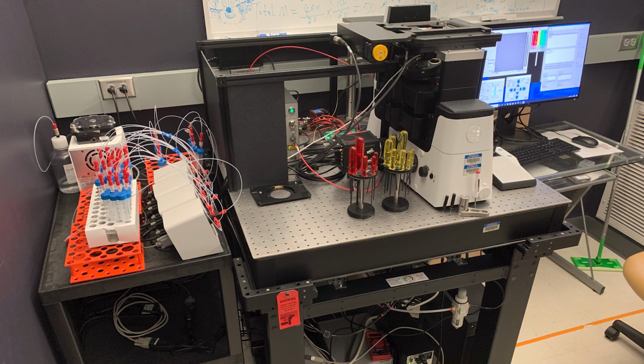The next steps of RAEFISH development include combining RAEFISH with tissue clearing to allow thick tissue profiling, further increasing the detection efficiency and coverage of RAEFISH, and developing in vivo applications of perturbed RAEFISH. To access the RAEFISH technology, a key requirement is to have an automated imaging and fluidics platform. We welcome researchers who are interested in setting this up to reach out to us, and we will provide instructions on several potential options of this setup.